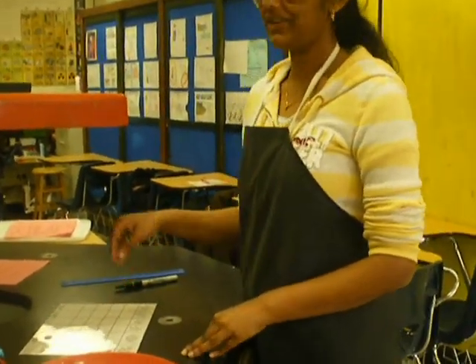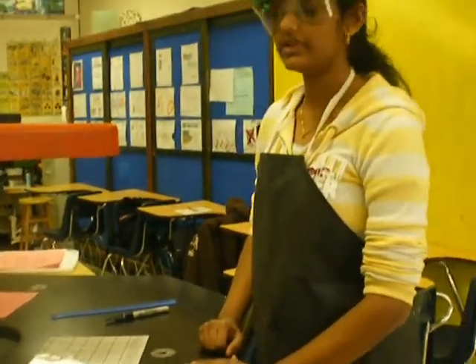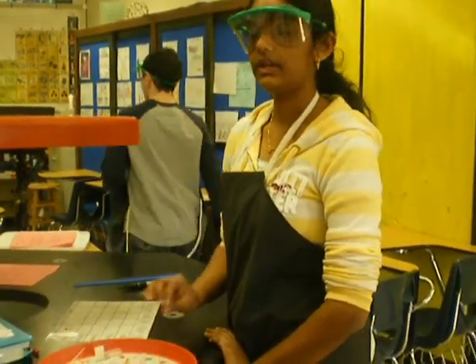You're going to be doing that for each square, and when you're done, just take observations and write the equations for all the compounds that did react and form the precipitate. Just as a note, the compounds that you'll be using are all in your little handy-dandy lab packet, so you're going to be basing your grid off of this mini grid to do the precipitate reactions.